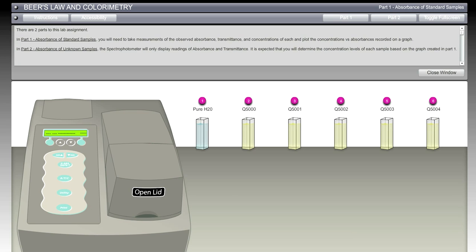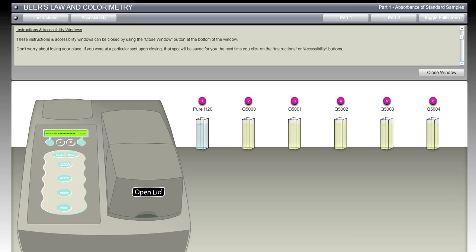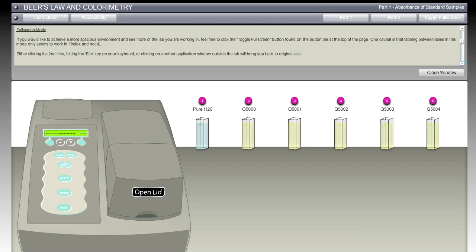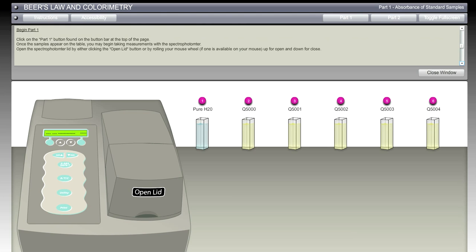So let's dive in. We tried to make it very intuitive and immersive and keep it so that students have to do the least amount of navigation to get to the content and instead spend most of their time learning the actual content, not trying to find out where it is.